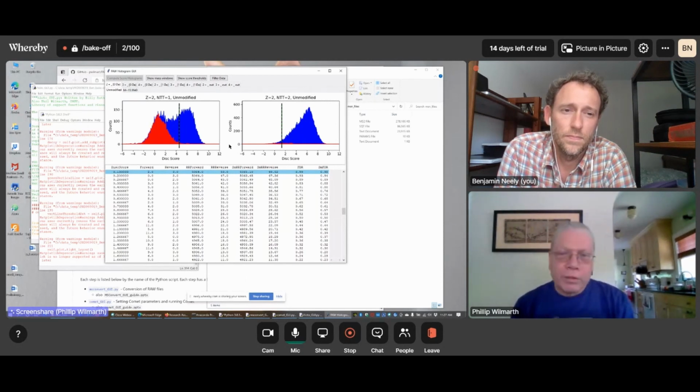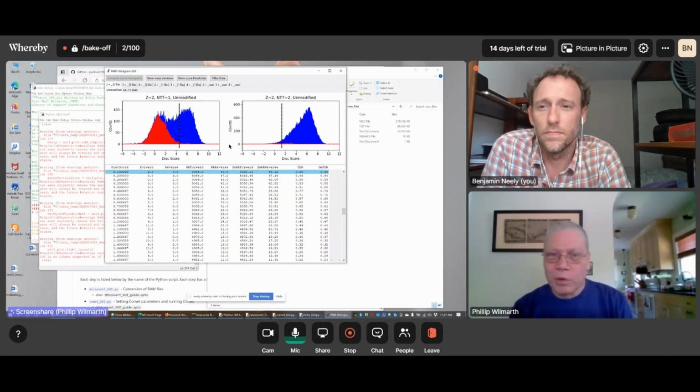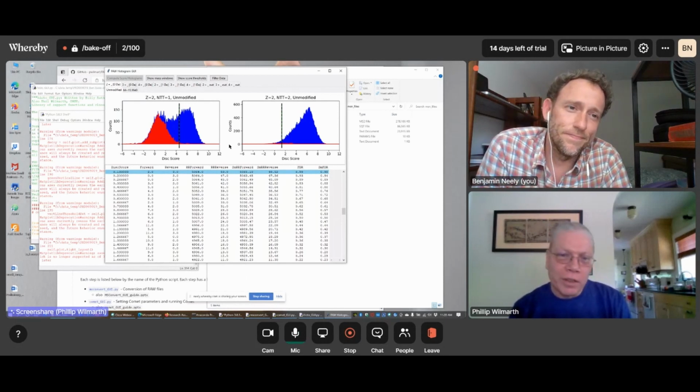But knowing whether, I don't think there's a signature, if you did a fully tryptic search, that those semi-tryptic peptides are there and you need to go redo your search. I think they pretty much stay hidden. So it's just like you say, kind of a domain knowledge thing.